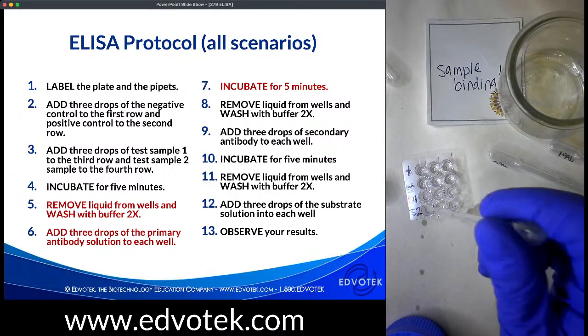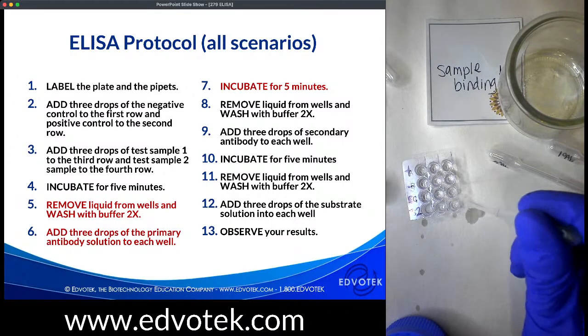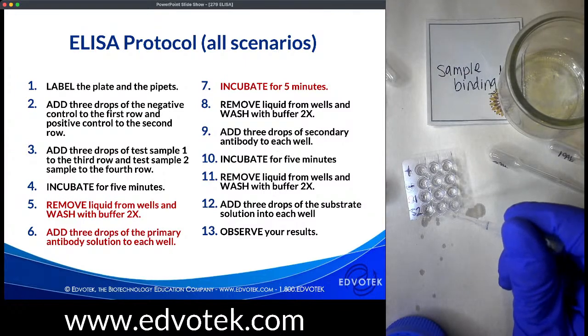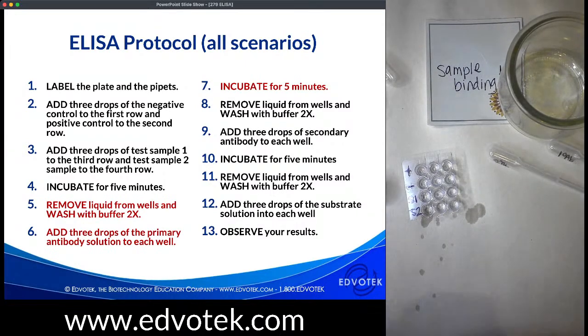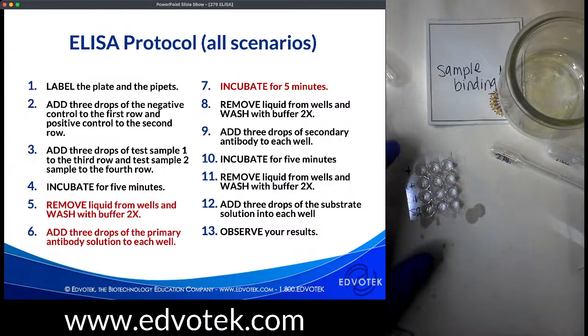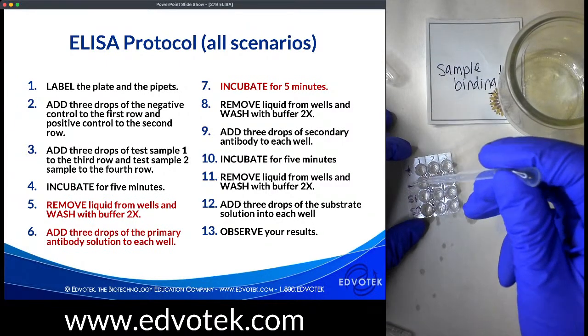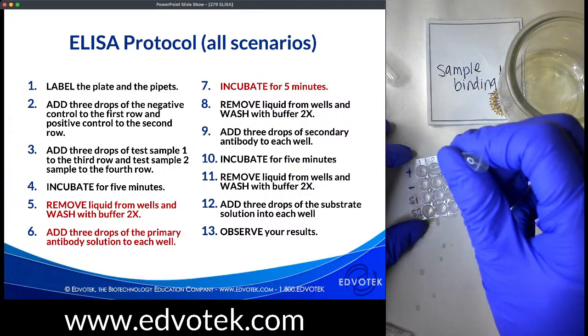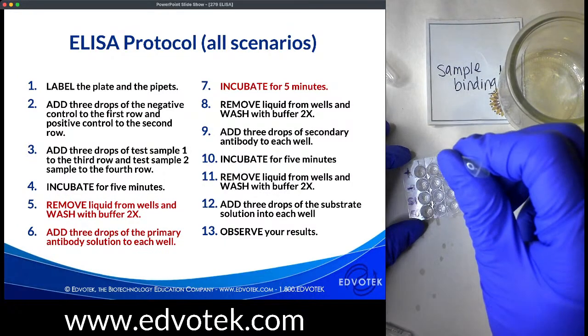So now is a great time to ask questions, because we are going to be doing a little bit of pipetting for the next few minutes. Trying not to make a mess. So this is my wash. We'll talk about what we're doing when we wash more in the next slide. I almost grabbed the wrong pipette. We're going to take our positive pipette and remove this wash buffer.